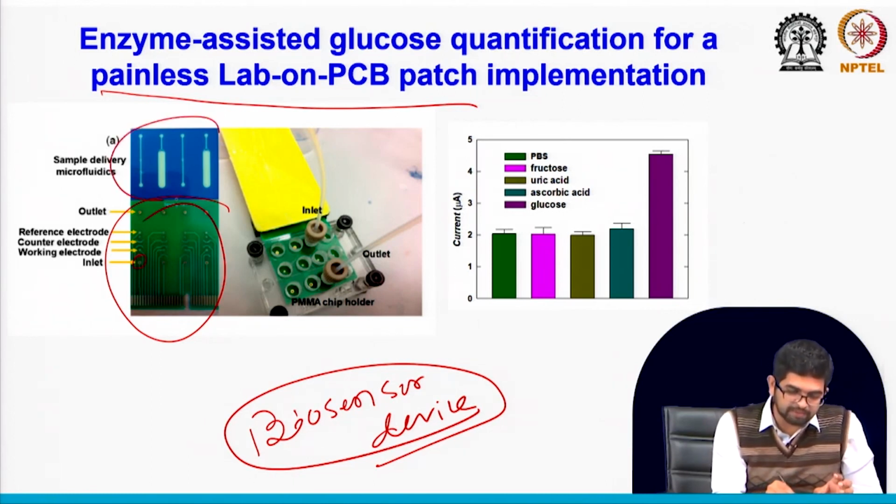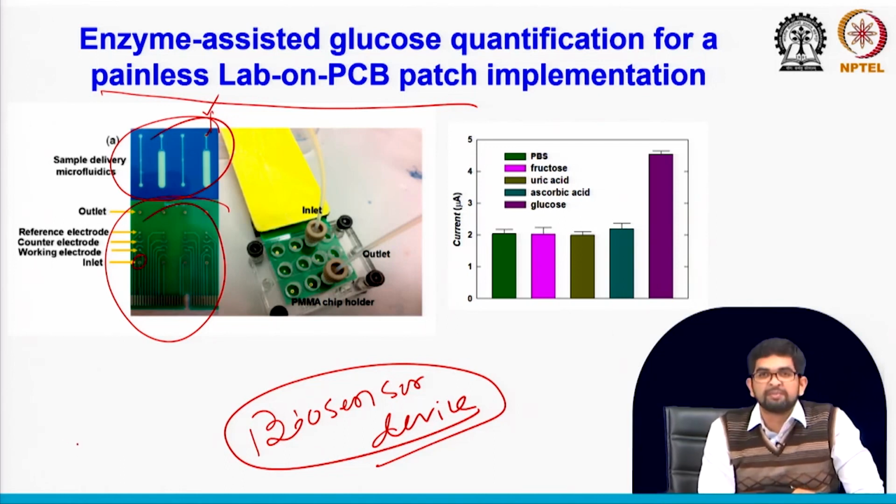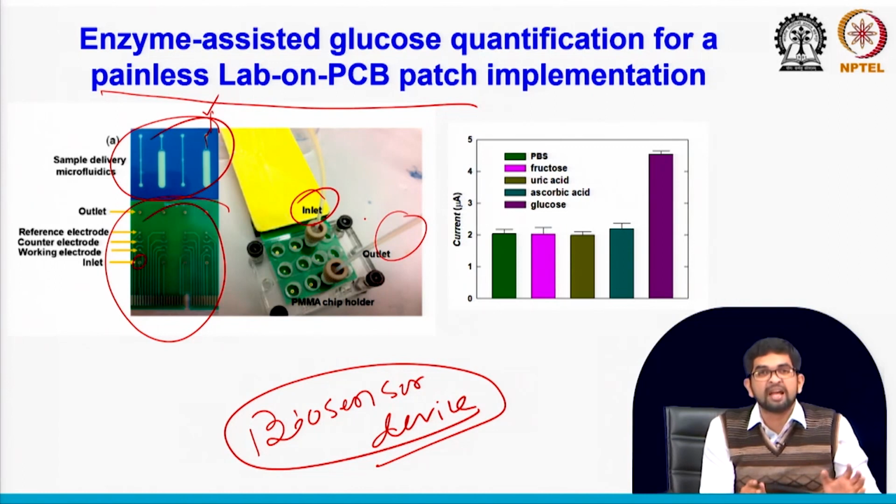We can integrate some microfluidics, and from here you can pass your real sample, like if you want to use the sweat sample, or maybe some serum sample. Then here you can see one inlet, one outlet. I mean, we can make a device. This is just the laboratory setup.